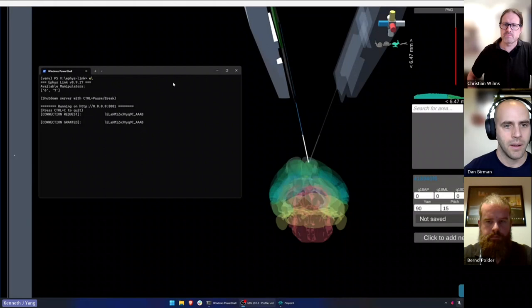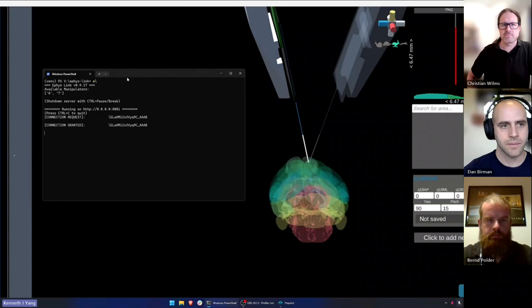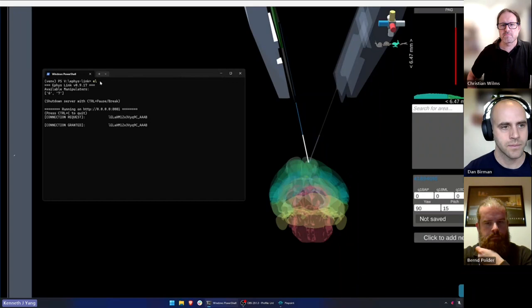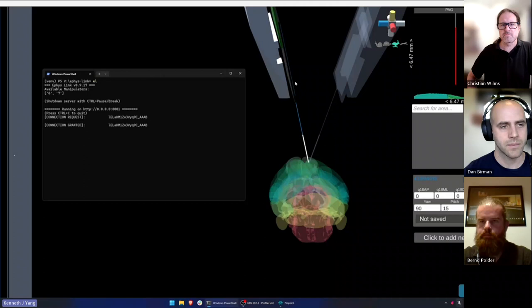Here is a desktop version of Pinpoint running, and over here I have a terminal window open. eFizzLink is a very small and compact Python server that just runs in the background — pretty much invisible once you get it up and running. Once launched, it's looking for manipulators. It detects manipulators numbers six and seven, which are just the numbers I have in front of me, and it's relaying the information to Pinpoint.